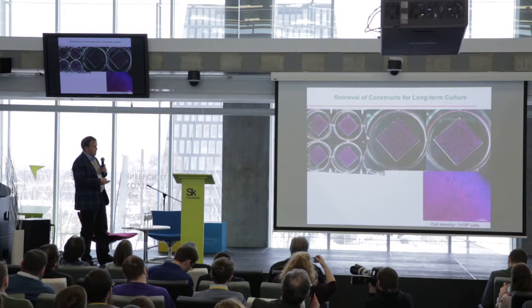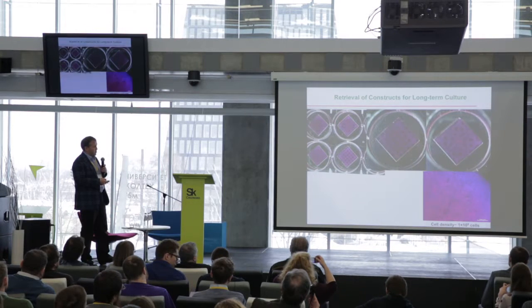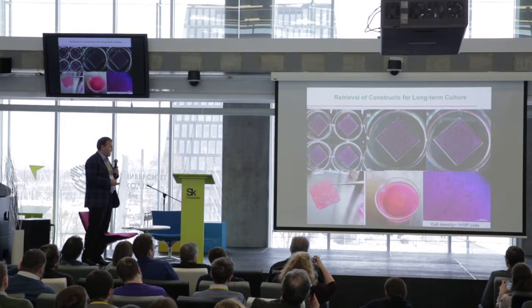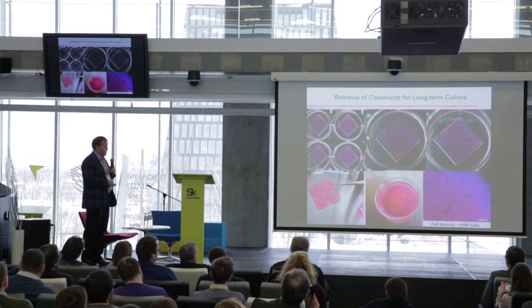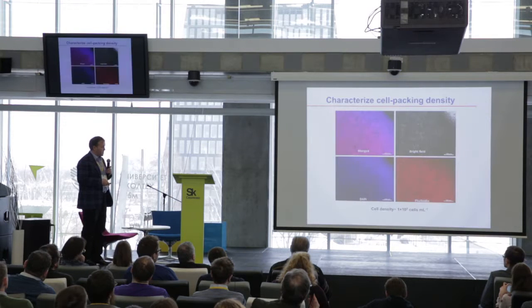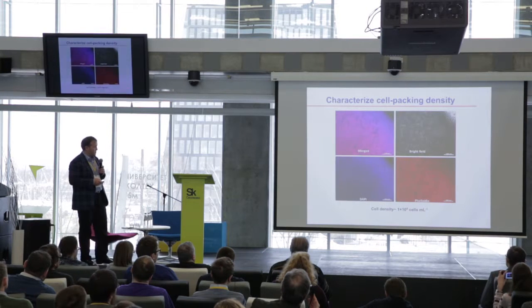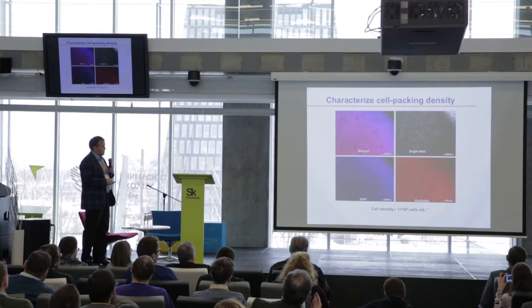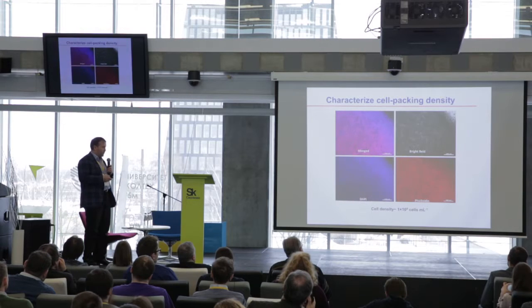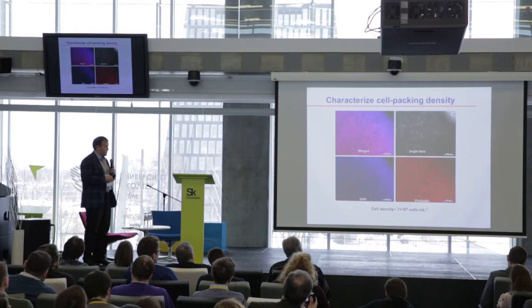It takes about 10 to 20 seconds to assemble things, and then we just wait for the fibrin to gel so that you assemble. The pink parts are the cells, so you can actually see a very high density of cells. This is really high, what you would achieve with spheroids, and this matters for tissue engineering. A high density of these cells a minute after, at the beginning of the construct, can allow early interactions and function.